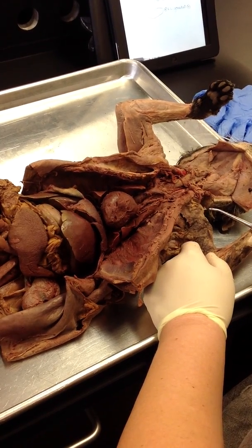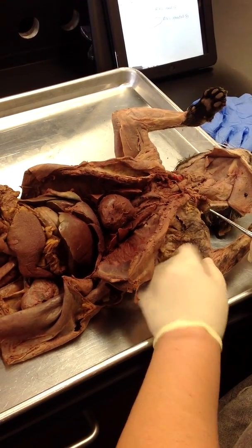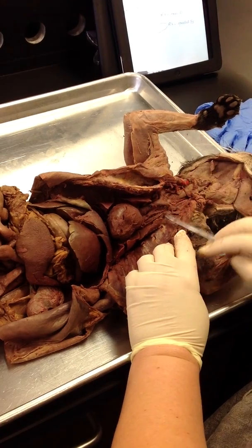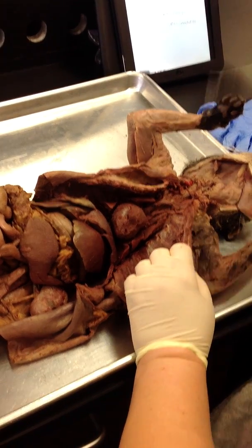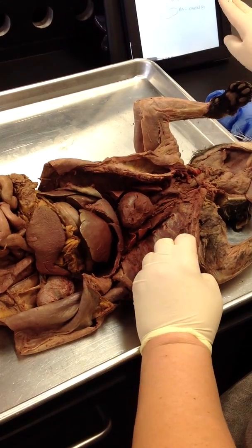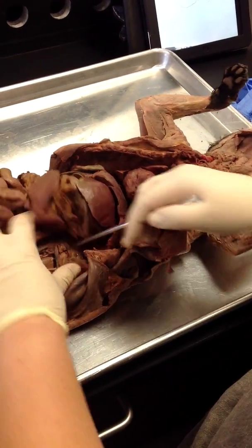Did you do the brachiocephalic? Yeah. Okay. That's the brachiocephalic vein. Superior vena cava, left brachiocephalic, right brachiocephalic vein, and it splits. Okay, so if you look at them once and then you just remember the branching pattern, right? It's not so bad.